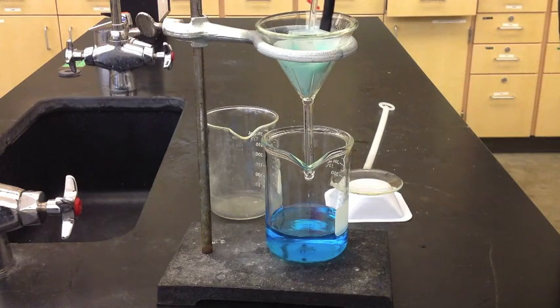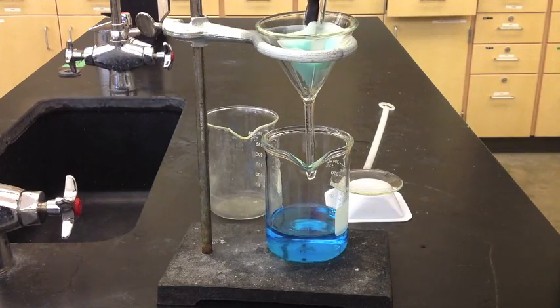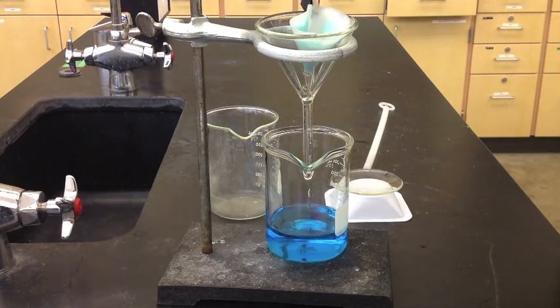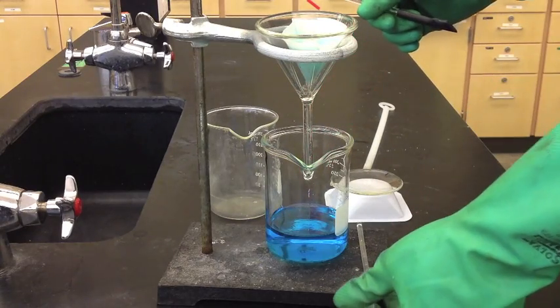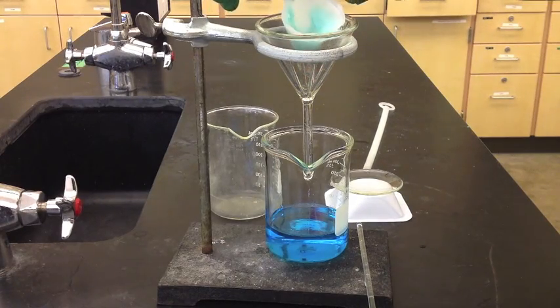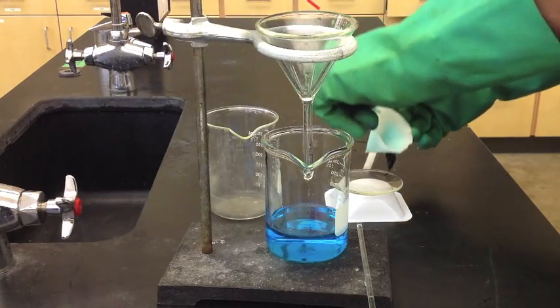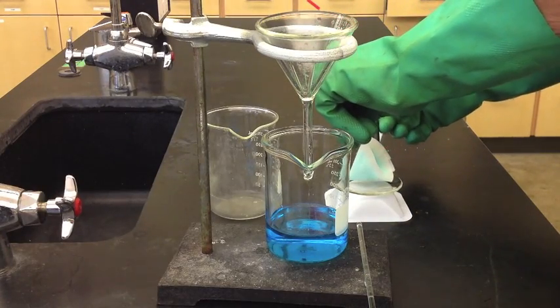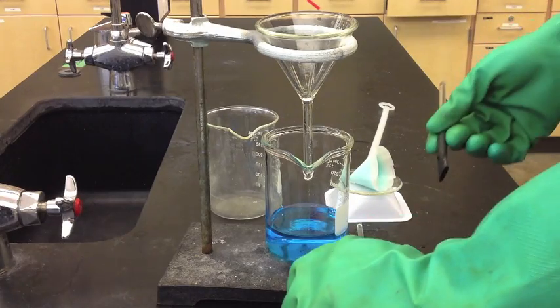Then use forceps to lift the filter paper. You want to lift it by the side that has the three folds, not the single-fold side. There's quite a bit of material, so if you lift it by the single fold there's a good chance you'll rip the filter paper. Lift it up and set it on a watch glass — just make sure you number your watch glass before you place the filter paper on it.